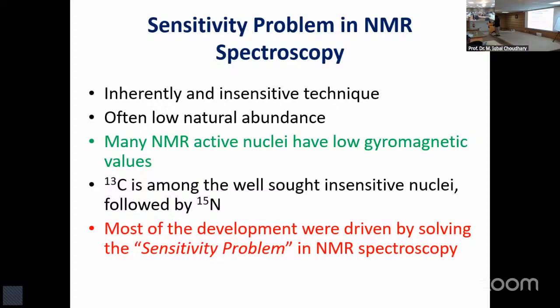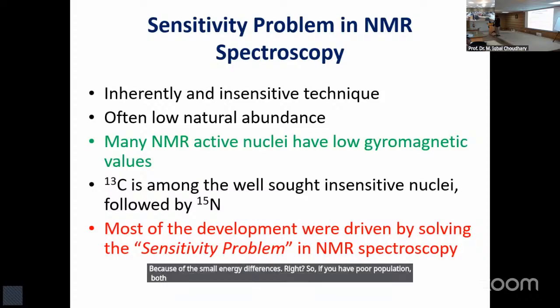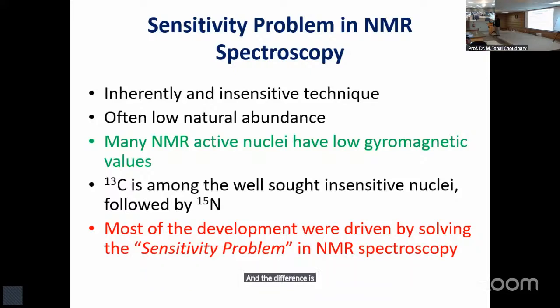Because of the small energy difference, right? So if you have both states populated, and the difference is so minuscule, it is very insensitive, right?